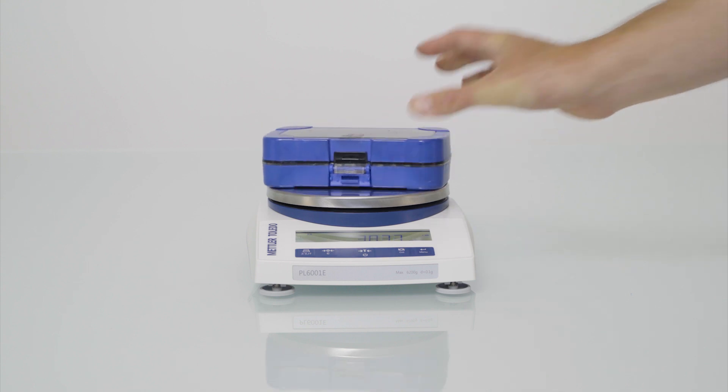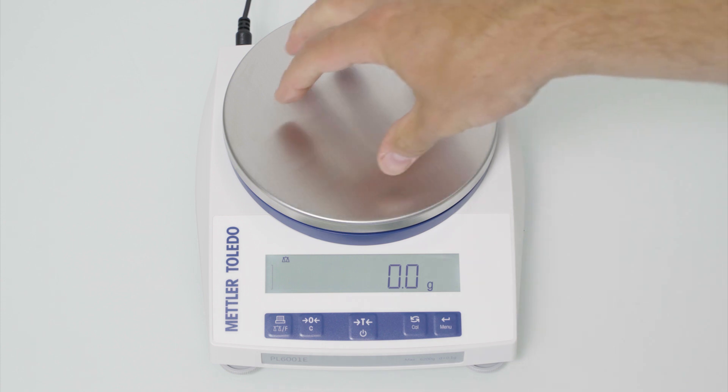The PLE offers a large weighing pan made from stainless steel which makes weighing of larger objects convenient. It also has an overload protection to help ensure a long balance life even under sub-optimal conditions.